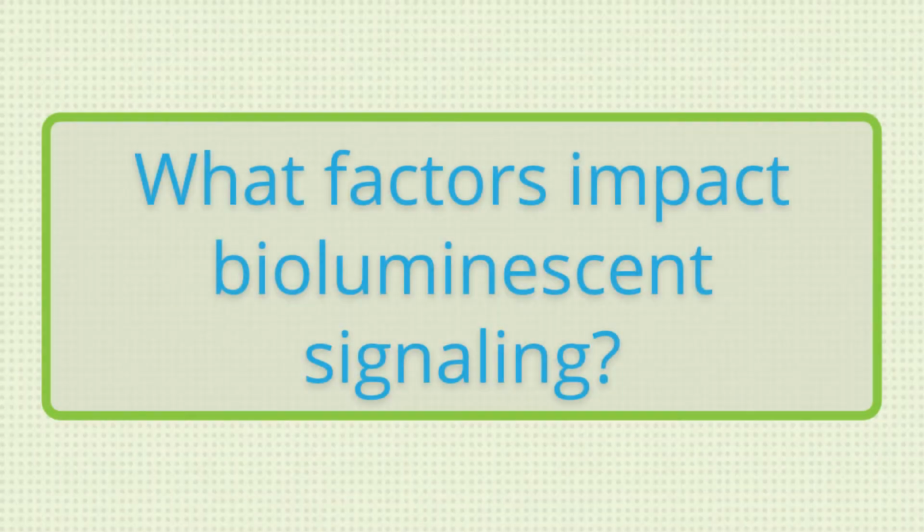There are so many different factors that can impact bioluminescence signaling, and I'm just going to list a few here, but don't let this intimidate you. Because if you take everything one step at a time and you do your kinetic curve, you're going to be sure that your experiment is optimized and reproducible.